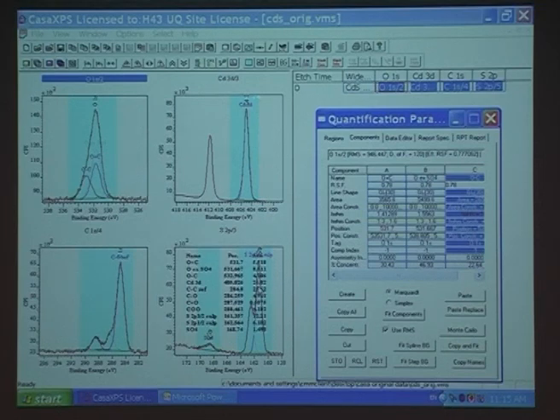And if you look up any cadmium binding energy things, you'll probably find that cadmium oxide binding energy is the same as the cadmium sulfide. So I can't see it in the cadmium. So this is what you've got to do. This can be backwards and forwards and take half a day if I wanted to nicely sort it out. I've got to get the numbers close, the binding energies have got to be close. And then I say, oh, I've got it.